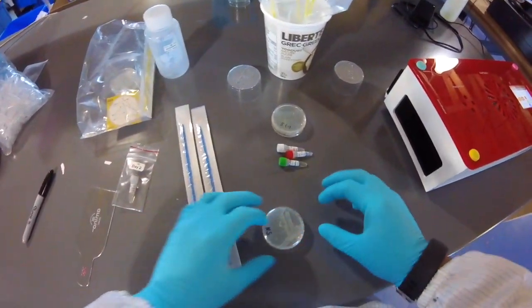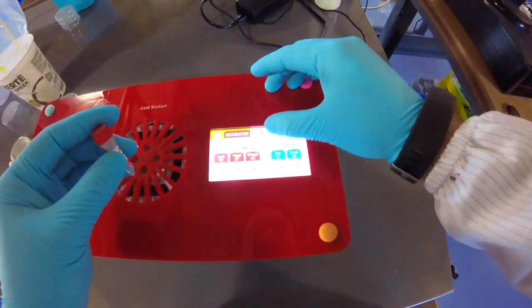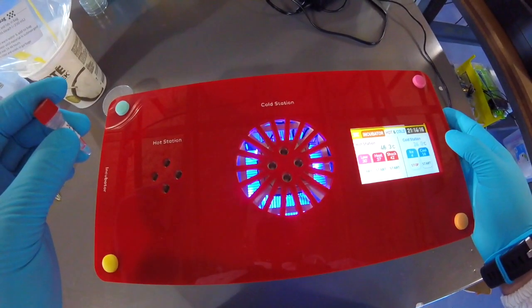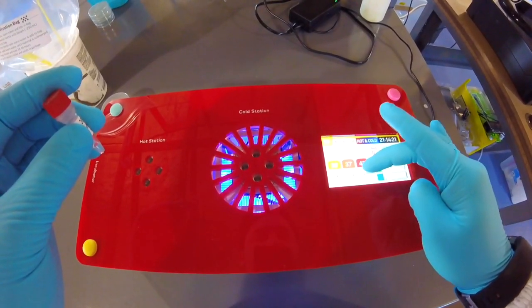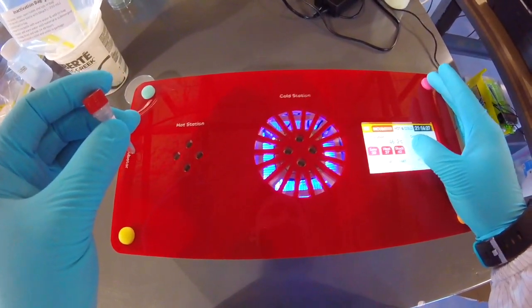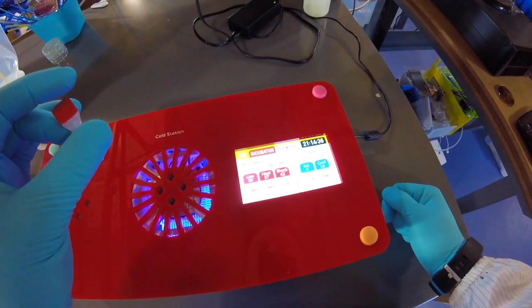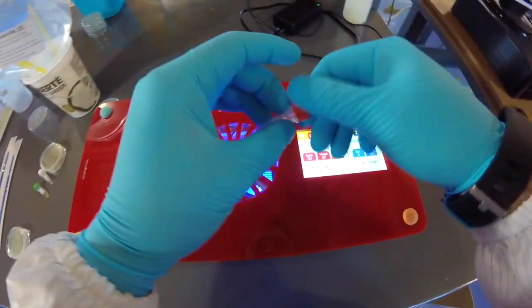Okay, so this step is pretty straightforward. Just follow the instruction manuals, but we're going to need the cold station, so I'm just going to turn on the cold station here so that you can see that there's ice and there's 16 degrees. You definitely want the ice, and you'll see the blue light come on. We're also going to be doing a heat shock, and so right now the incubator is on, but we're going to turn on the hot station here because we're going to need it at 42. If you turn that on right now, it will slowly cool down from its point. Give it 5 to 10 minutes. It should cool down to 42 Celsius, which you'll use for this activity. The cold station will cool down over a couple of minutes to 4 degrees.